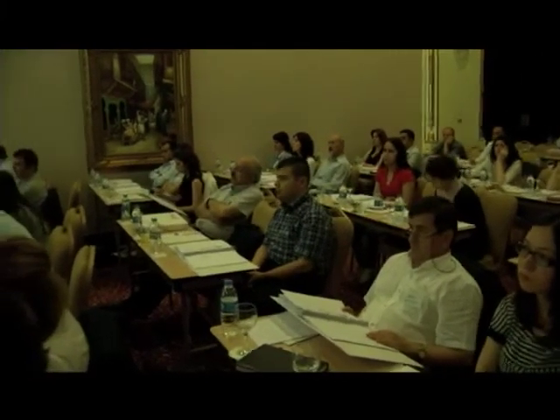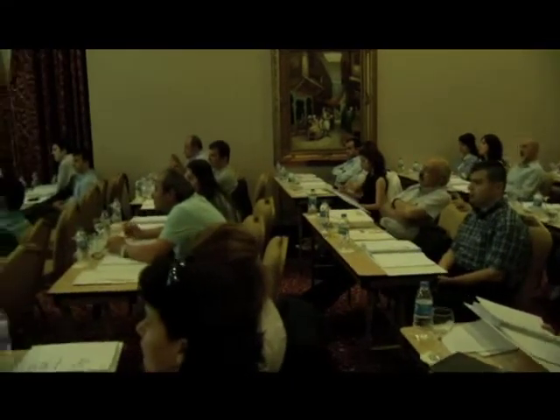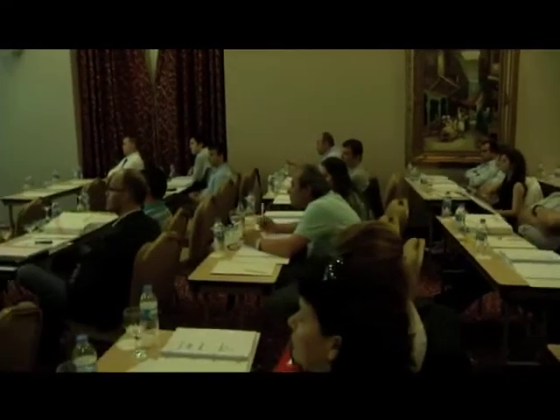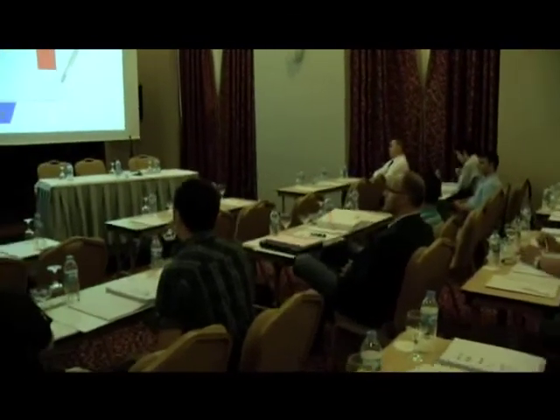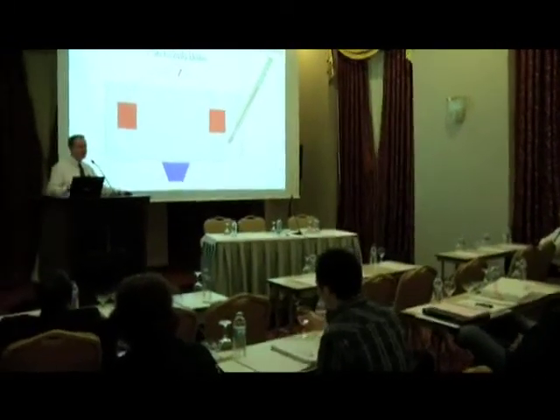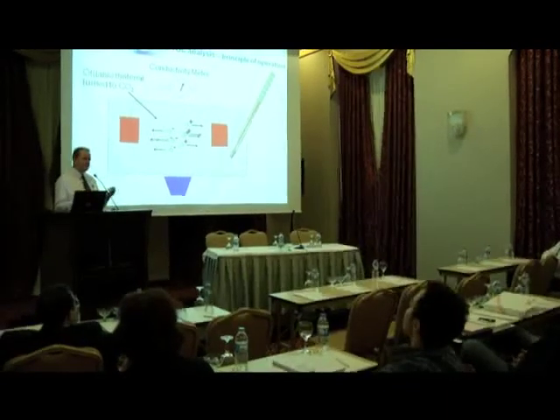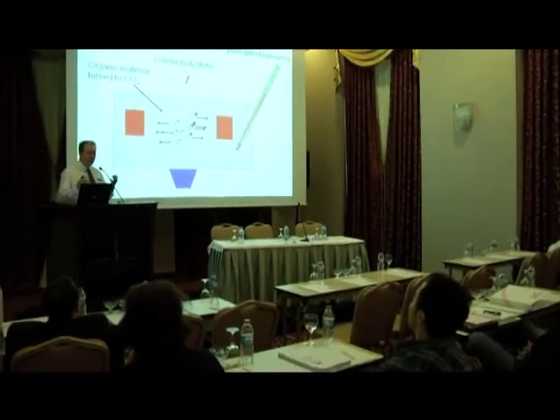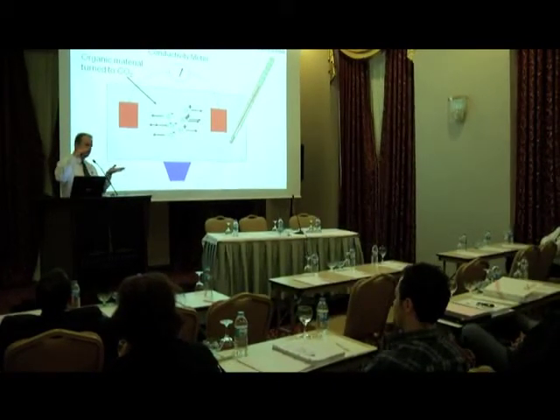The UV lamp puts energy into the water and it breaks all of the organic materials down into their constituent parts. And eventually they come down to carbon dioxide and water. The carbon dioxide dissolves into the water and then increases the conductivity. So now we have more conductivity, and by measuring the difference in that conductivity between the start and the end, we can then tell you how much organic material there is in the water system.